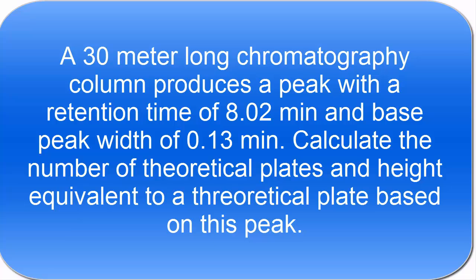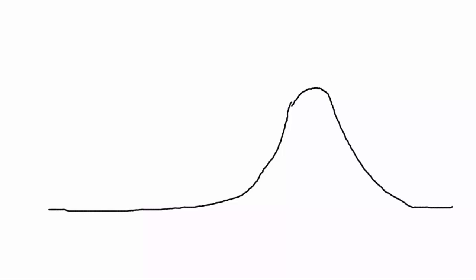An efficient column will produce narrow peaks even after a long retention time. So if we can think of an ideal peak, and we always draw peaks ideally as kind of Gaussian peaks, it's worth remembering that peaks may not always be Gaussian.